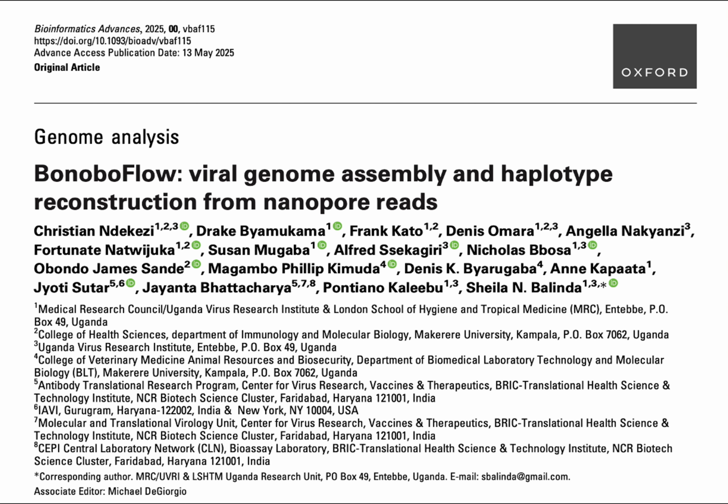What about the newer third-generation sequencing platforms? Absolutely. And this is where the story gets really compelling. Newer platforms like PacBio and Oxford Nanopore Technologies, ONT, brought something revolutionary to the table. Long reads. Instead of tiny fragments, they generate much longer stretches of DNA sequence, sometimes thousands of bases long, that can span much bigger genomic regions. So that sounds perfect for those tricky repetitive regions that confuse the short reads. Exactly. It helps resolve those ambiguities. I sense another but coming. There's always a trade-off. There often is, yes.